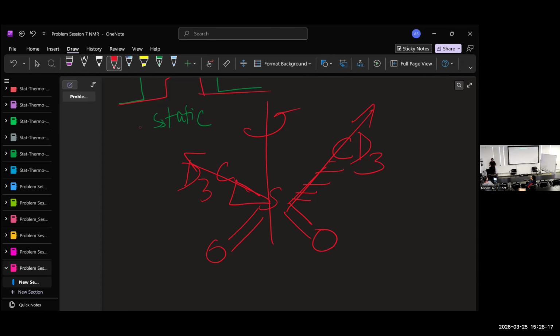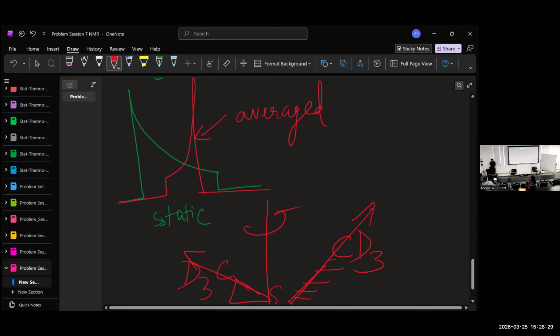And for this particular case, Kurt Zilm and David Grant have actually increased the temperature in very specific steps, and you can see how at the turning points of the average tensor, which would be here and here, you start to see horns emerge as you increase the temperature. The truly intermediate regime is thought of as having blob-like character, but you can see these horns emerging at the turning points of the average tensor. Then once you heat it up enough, you see the full average tensor, with no remnants of the low-temperature tensor.